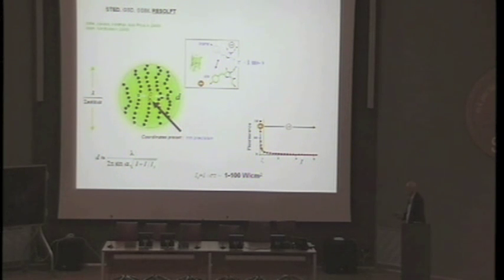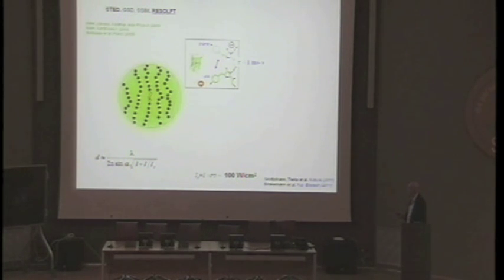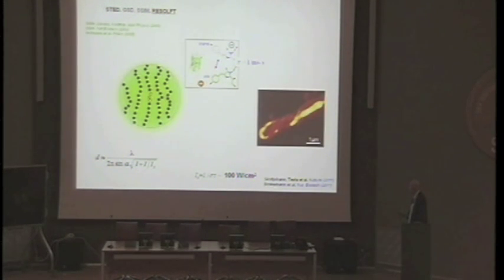Okay. Now, there's even the switchable fluorescent protein that can go from one state to the other. So I was excited about that because it means you have a genetically encoded marker, and then you go at low light levels, and great. But when we developed this, and we started out in 2003, we realized it's not very easy. You have to find a fluorescent protein that can be switched many times between on and off. And that turned out not to be very easy, so we had to work on the development of fluorescent proteins. And it took us some time to get them, most of it random mutagenesis. And in the end, we got them.